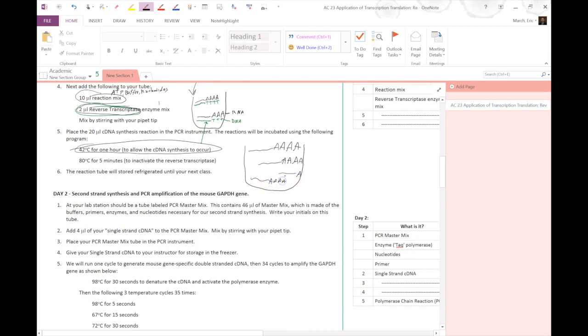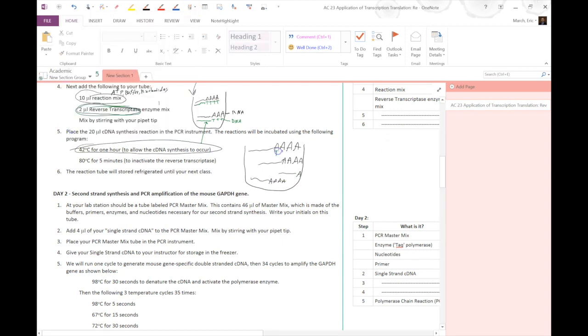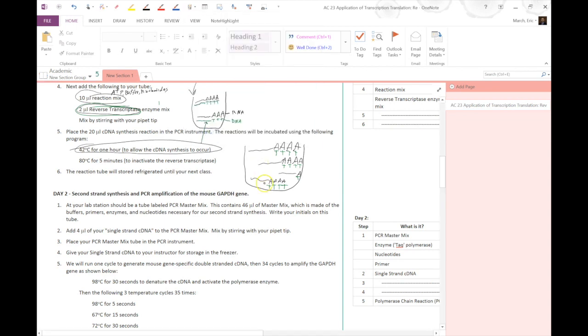All we did yesterday was add a whole bunch of tails of T's, so they would bind to the poly A tails of all these mRNAs that are in our test tube, and then we allowed reverse transcriptase, an enzyme, to go backwards along here. It binds to these poly T tails, and then it runs backwards and makes a cDNA copy of the mRNA.